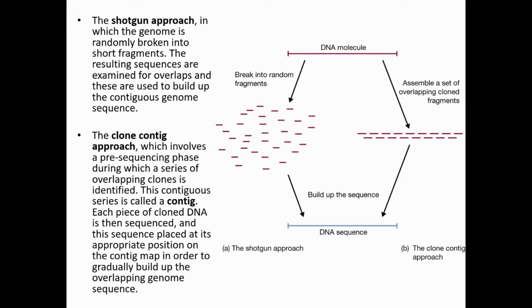To obtain a random overlapping fragment, the genomic DNA is usually sheared, and the shearing conditions are optimized to obtain the uniformly sized DNA fragment.